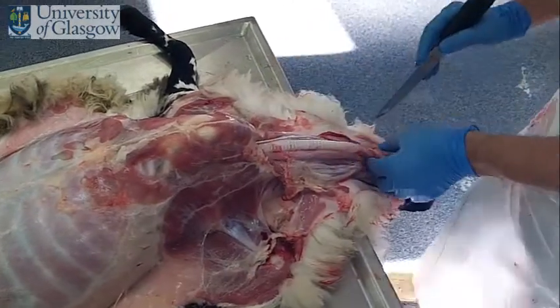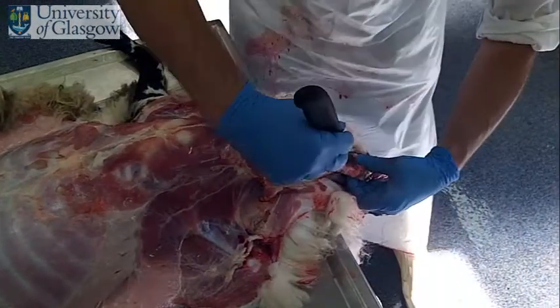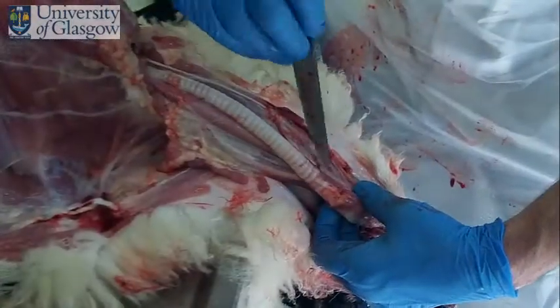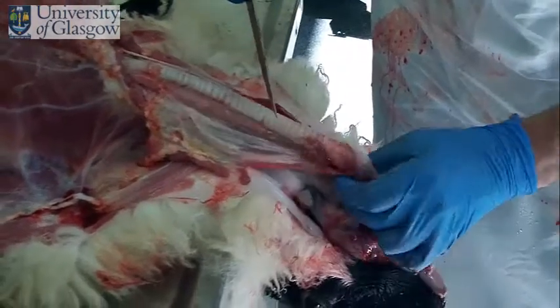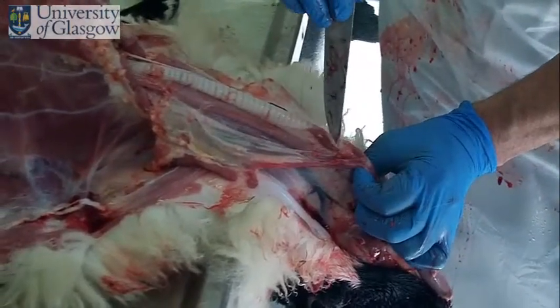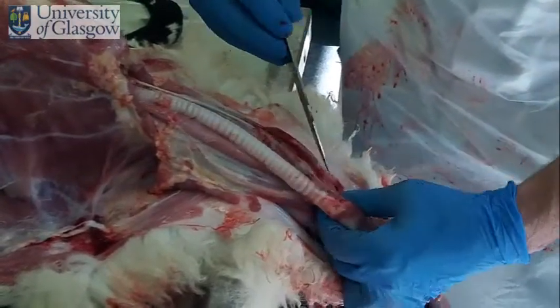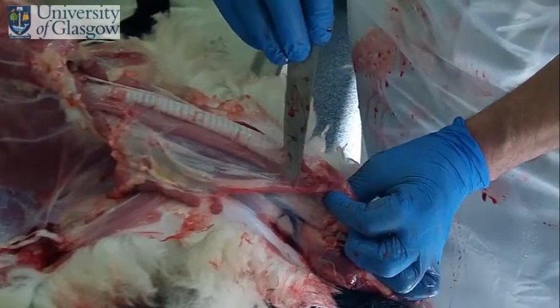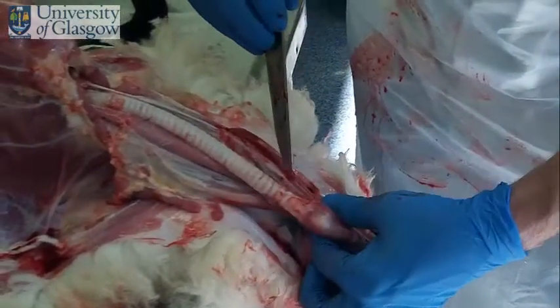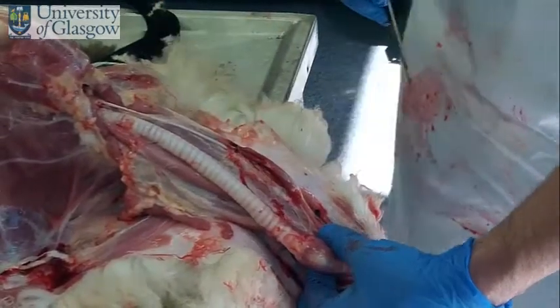Taking this down a little bit further, we can lift this up and we can see the thyroid on this side — you can see it just there — and the thyroid on this side here. They're usually just slightly darker than the muscle around about, usually fairly easy to see. They should be fairly prominent, and they are in this case.